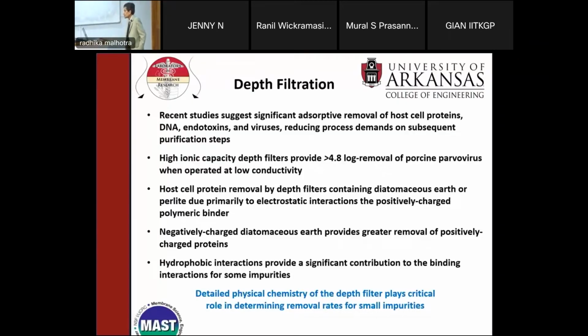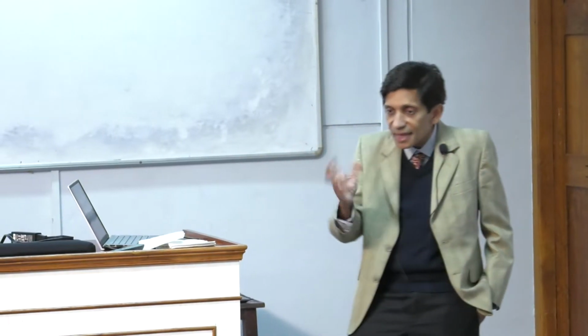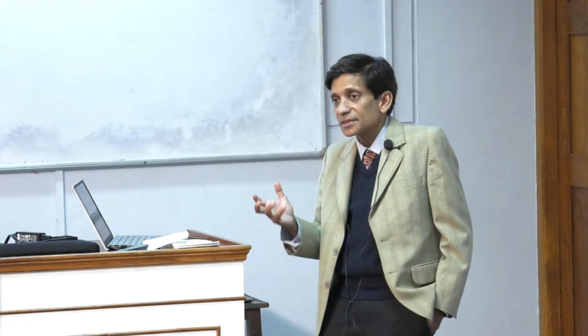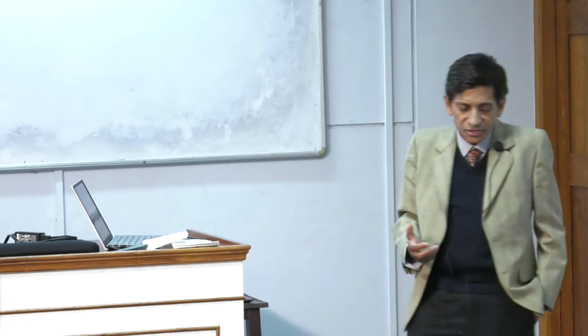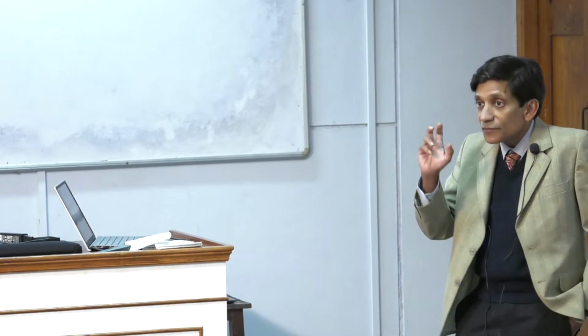Recent studies suggest that significant adsorptive removal, this is what I mentioned earlier, of host cell proteins, DNA, endotoxins, and viruses also occurs or can be designed into these depth filters, which will reduce the load on subsequent unit operations. So in fact, today most of the research that focuses on depth filters focuses on designing depth filters that are able to conduct multiple functions.